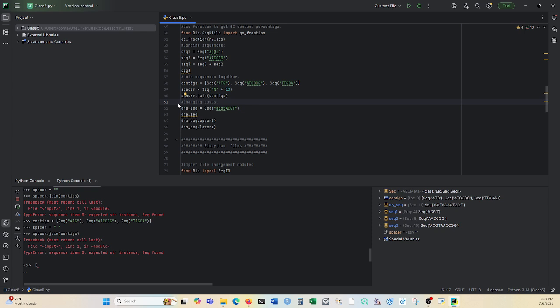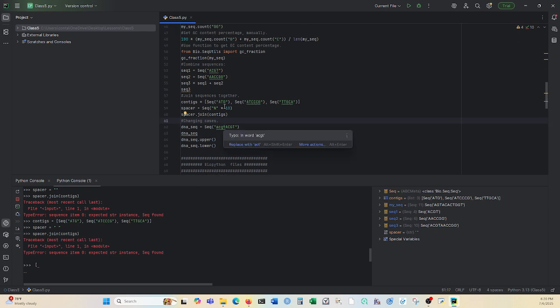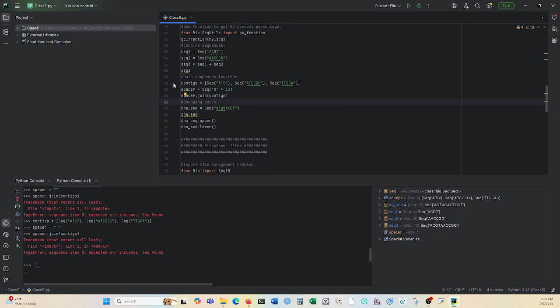So now another important thing when you're analyzing sequencing data is sometimes the capitalization is wrong, and since Python is so case sensitive, if you have a sequence that is partially capitalized and uncapitalized, that can actually mess it up because it will treat lowercase a and capital A differently.